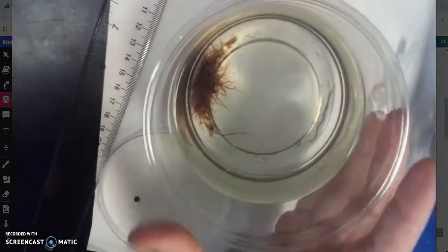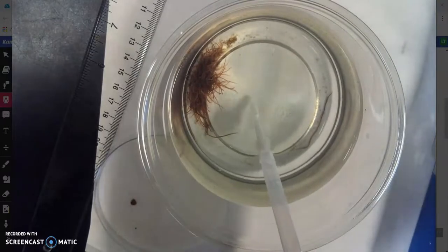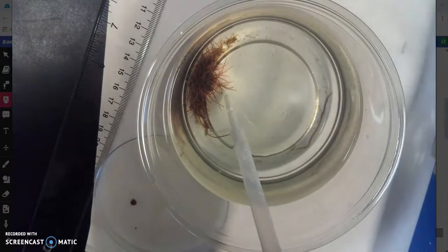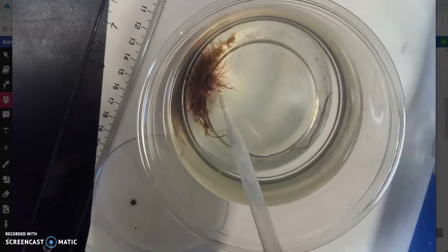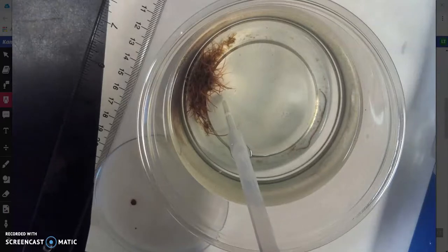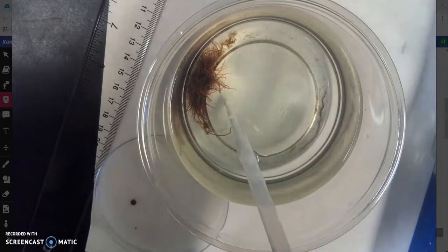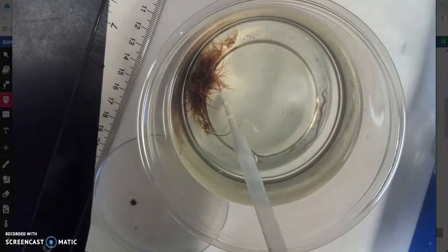As you can see in this bowl, we have the California blackworms, and they're all over here in a big group. They do that for several reasons. They like to group together for safety, but also they like to group together for probably warmth, because the water temperature is a little cool right now because it's cold weather, winter time. So they're all kind of bundled up together.